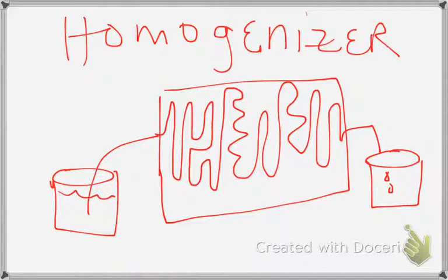And it goes really fast. Whereas this French press, you take so much pressure that you kind of go slow. The sonicator, you have to do multiple cycles. Usually with one to two passes through the homogenizer, they're broken open. Okay, because they just literally ran over themselves and crushed themselves open.